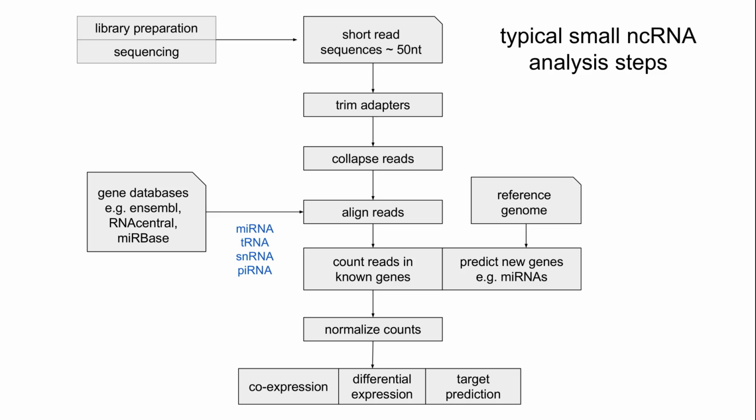So the rest of this video is an overview of how to use this package, smallrnaseq, to perform this workflow. And anyone who's familiar with RNA-seq analysis in general can see that it's essentially the same methodology, with the main difference for small RNAs being the length of the reads, which are usually below 50 nucleotides. And that really is important later on when you come to do the alignment, as we'll discuss.